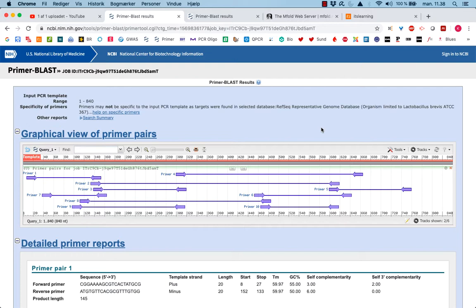The last thing we want to check is if the product will have any kind of secondary structure that would interfere with the binding of the primers. And to do this we have to do a number of things.